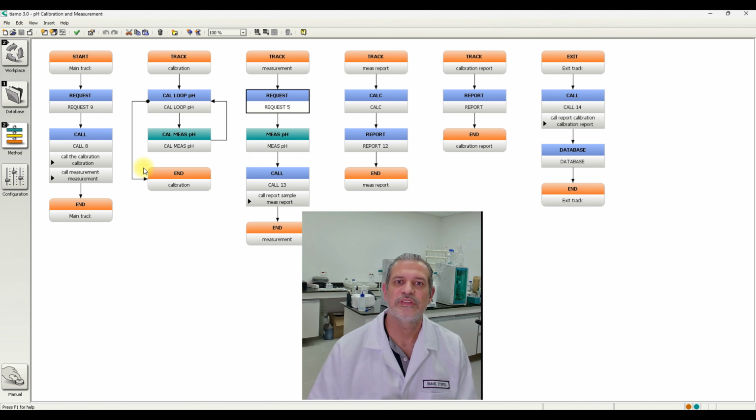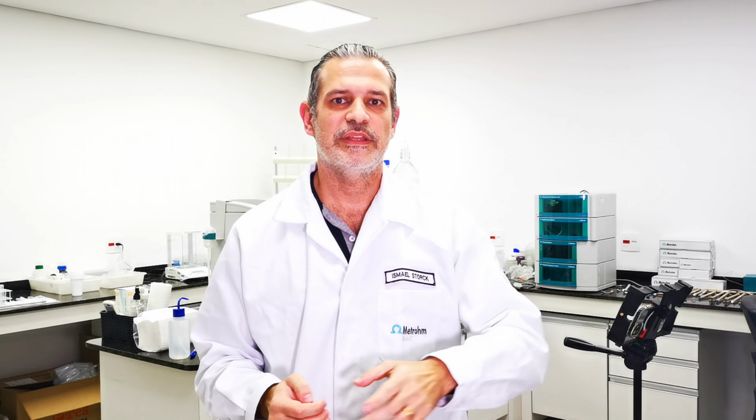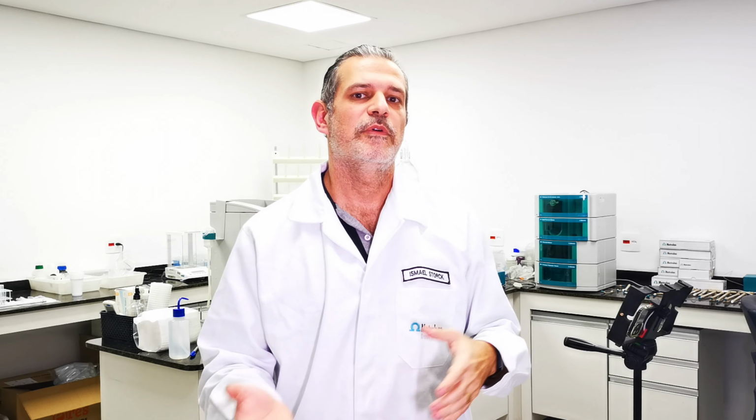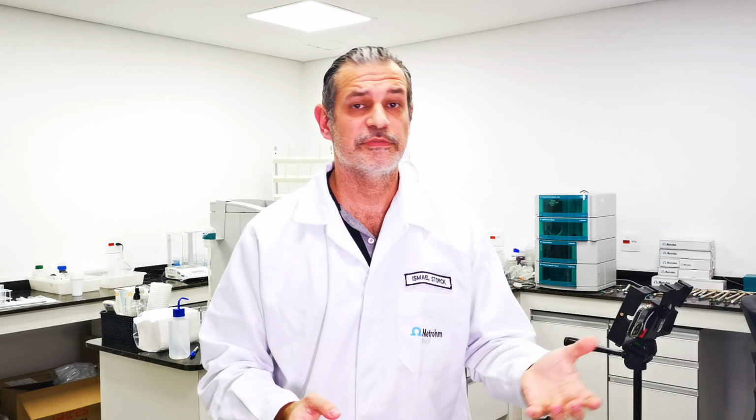So this is how we can use all the power of the software Tiamo in the benefit of your analysis. So in this video, you have learned how to create just one method to perform both calibration and the measurement, the pH calibration and measurement of your sample.